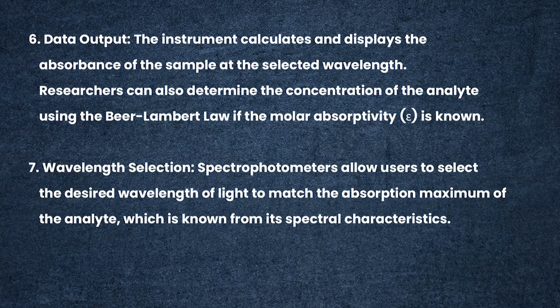The concentration of the analyte can be determined using the Beer-Lambert law if the molar extinction coefficient is known. You can also plot a standard curve for a particular analyte, so that on the basis of absorbance we can calculate the concentration of the analyte.